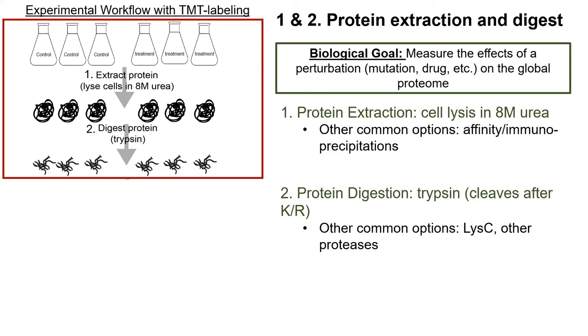Say you are really interested in looking at lysine modifications. Maybe using a protease that cleaves after lysines wouldn't work as well for your experiments. So just be aware that there are other options out there, but digesting whatever protein you extracted with trypsin is the standard step.